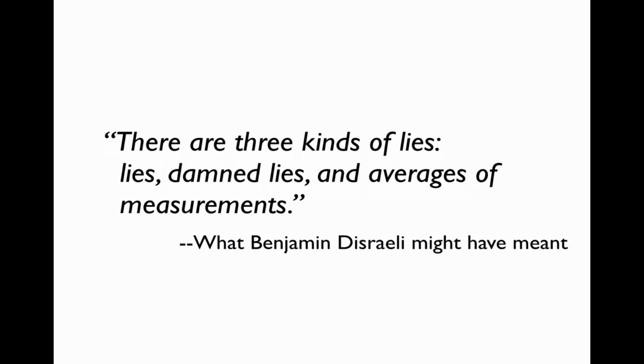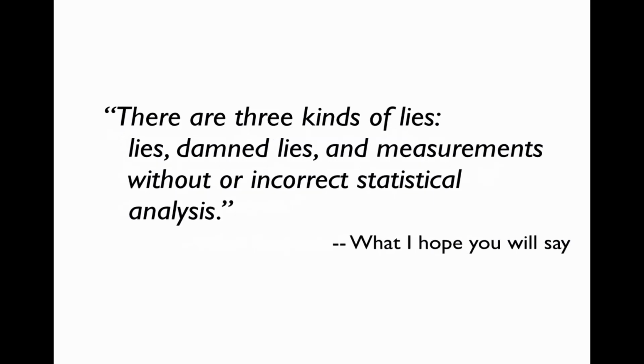Actually, if you just do averages of measurements, you are missing out on all the statistical properties of your measurement process. And I hope that you instead think something different in general about science. I would hope that you will say that there are 3 kinds of lies: lies, damn lies, and measurements without, or with incorrect, statistical analysis.